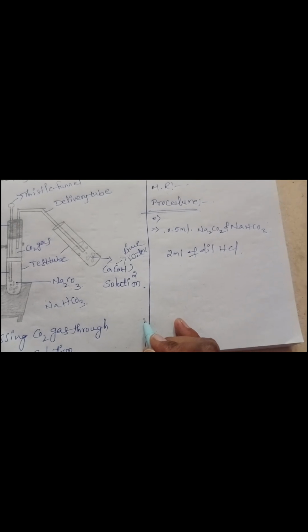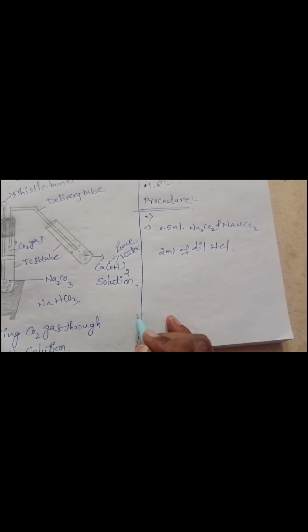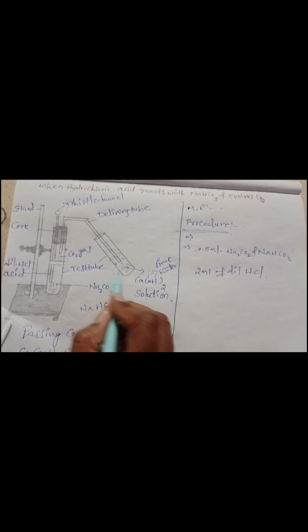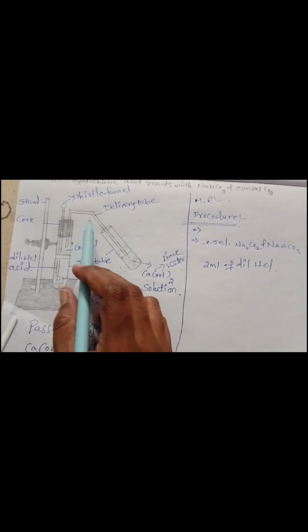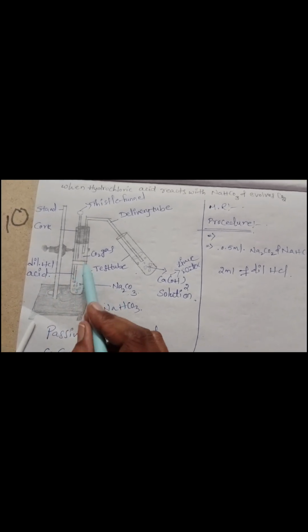We need to pass the gas produced in each case through lime water. So in another test tube, we take the lime water. These 2 test tubes we connect with the delivery tube. When the hydrochloric acid reacts with the sodium carbonate, it releases carbon dioxide gas.